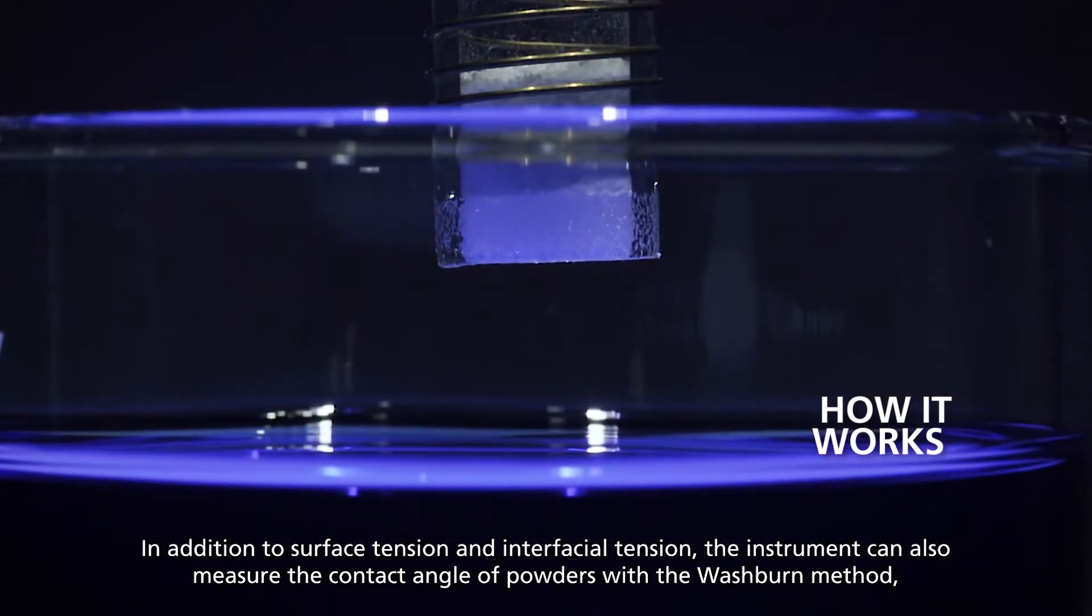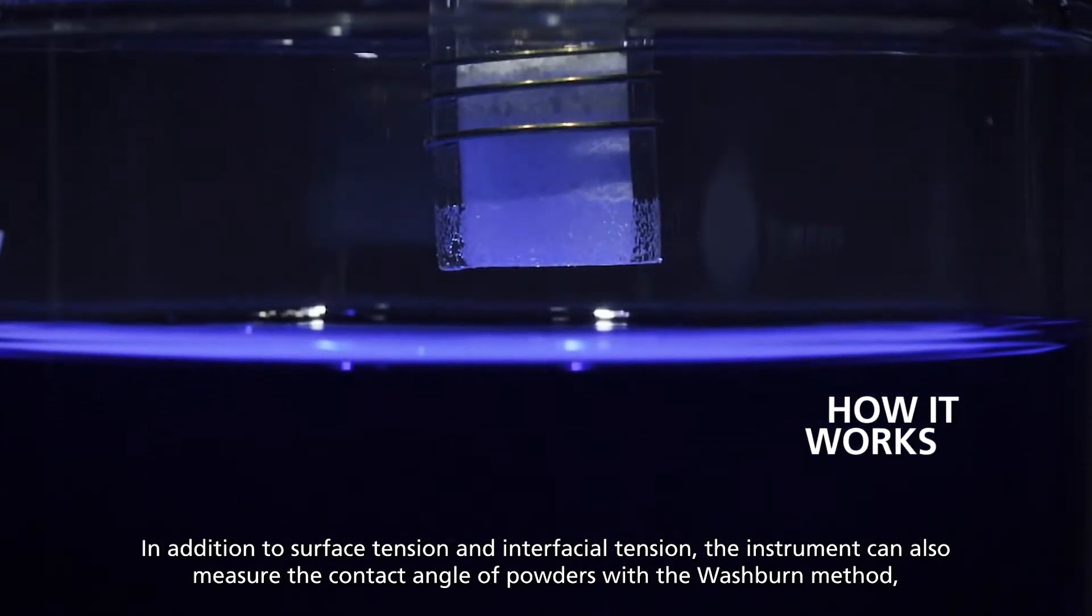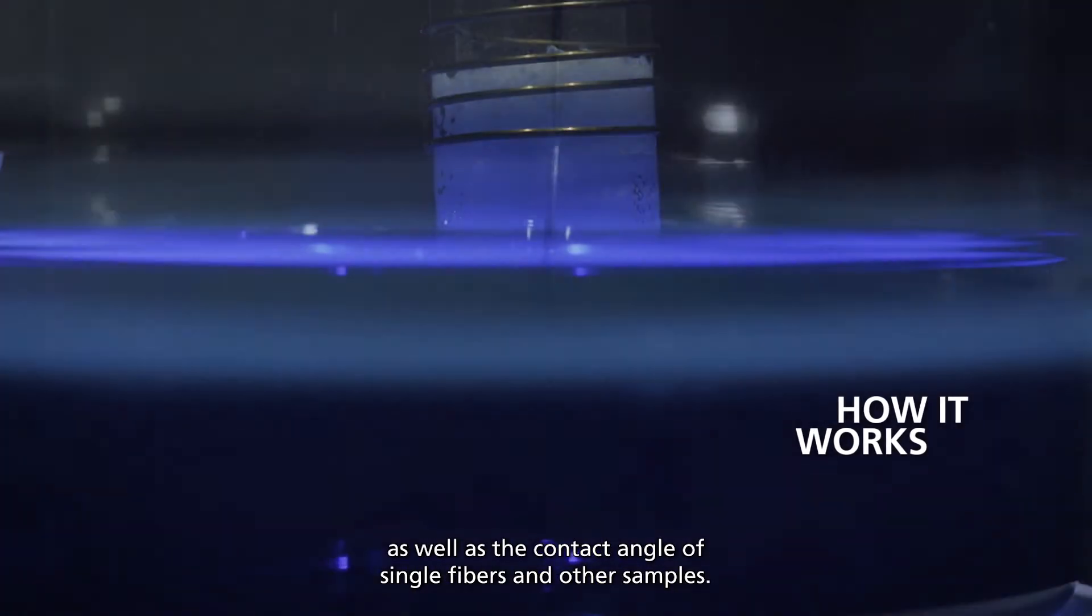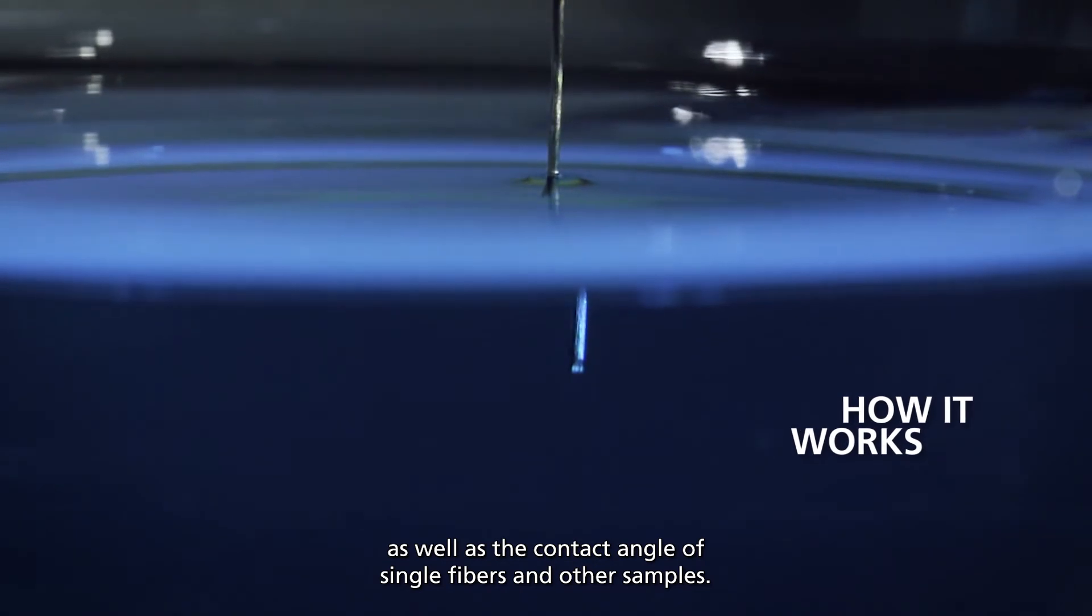In addition to surface tension and interfacial tension, the instrument can also measure the contact angle of powders with the Washburn method as well as the contact angle of single fibers and other samples.